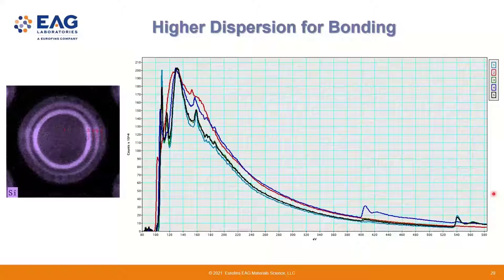Good. Then what else do we have? Maybe, yeah, I just have one comment. In our lab, we do have the monochromation, right? I just didn't turn it on because it will reduce the probe current like crazy. So yeah, it's good to have, but not always necessary.